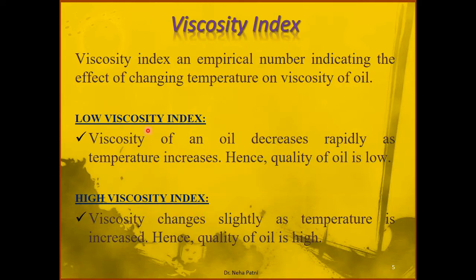Basically viscosity index is a number. If I rate or give marks to any lubricant on a scale of 0 to 100, near 0 it would be a low viscosity index oil, and if I give 100 on 100, it would be a high viscosity index oil. So obviously our sample lies in between this range, 0 to 100.